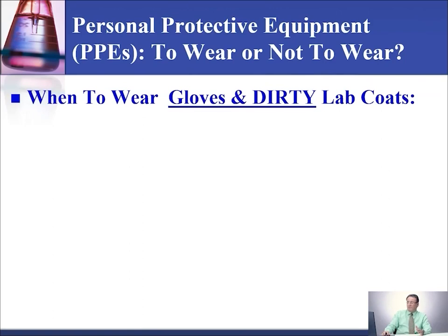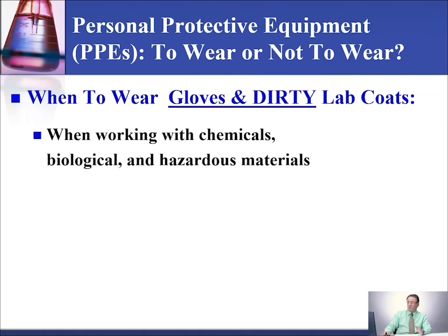When to wear gloves and dirty lab coats. That's the next thing we're going to talk about. What do you mean by a dirty lab coat? It doesn't mean it needs to be washed, but dirty because we use it in the dirty area. It's a special lab coat used to work on the bench to deal with contaminated material. That's why we call it a dirty lab coat, because you could have a clean lab coat.